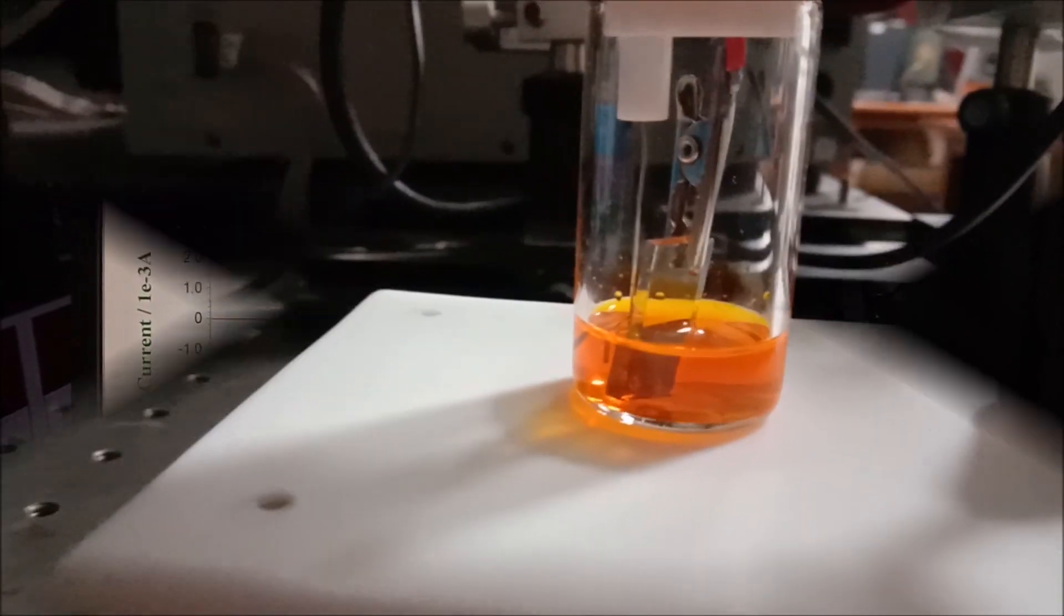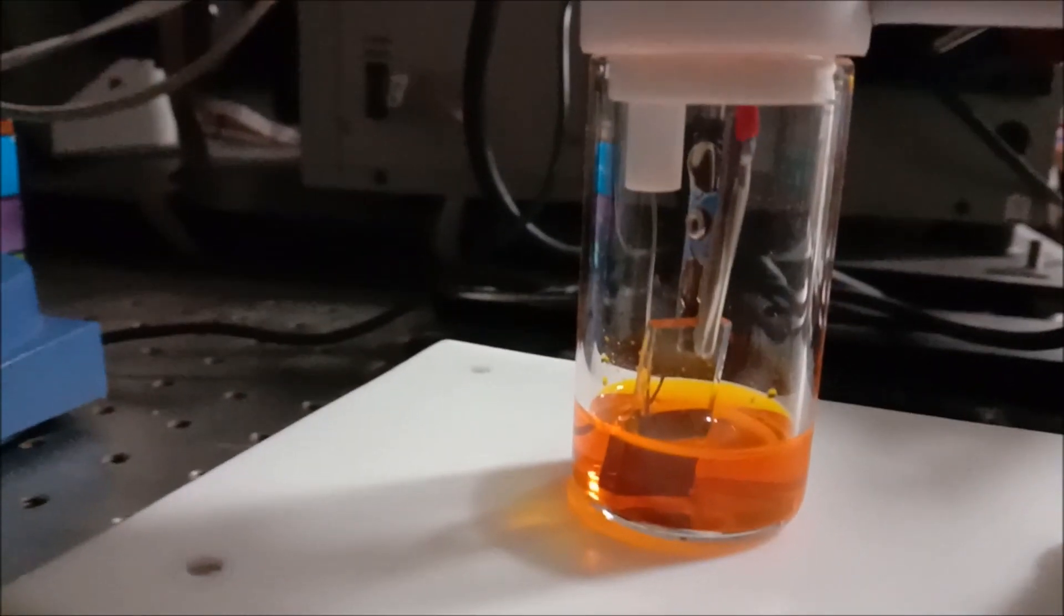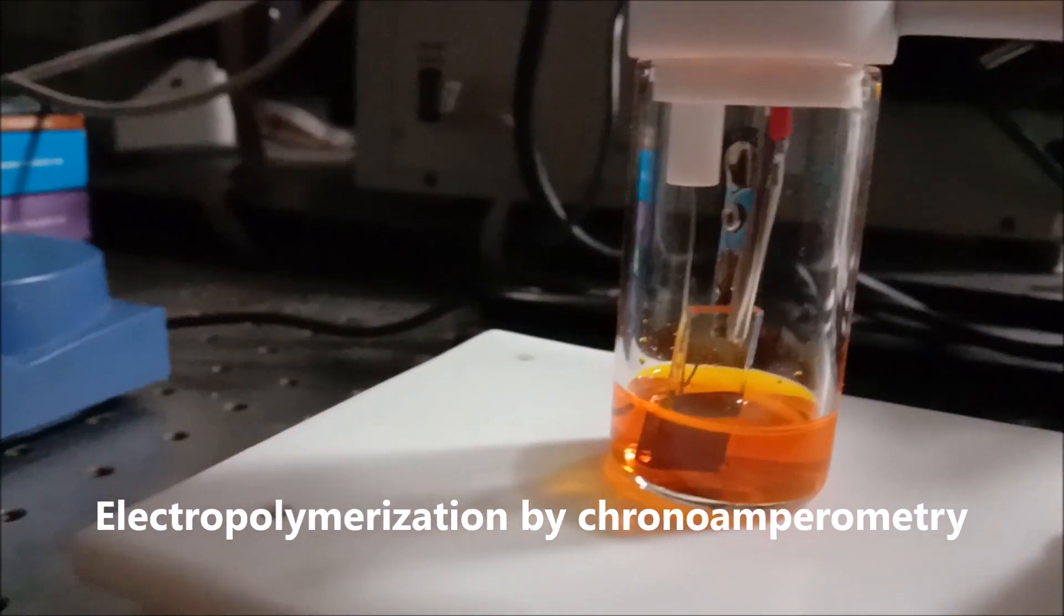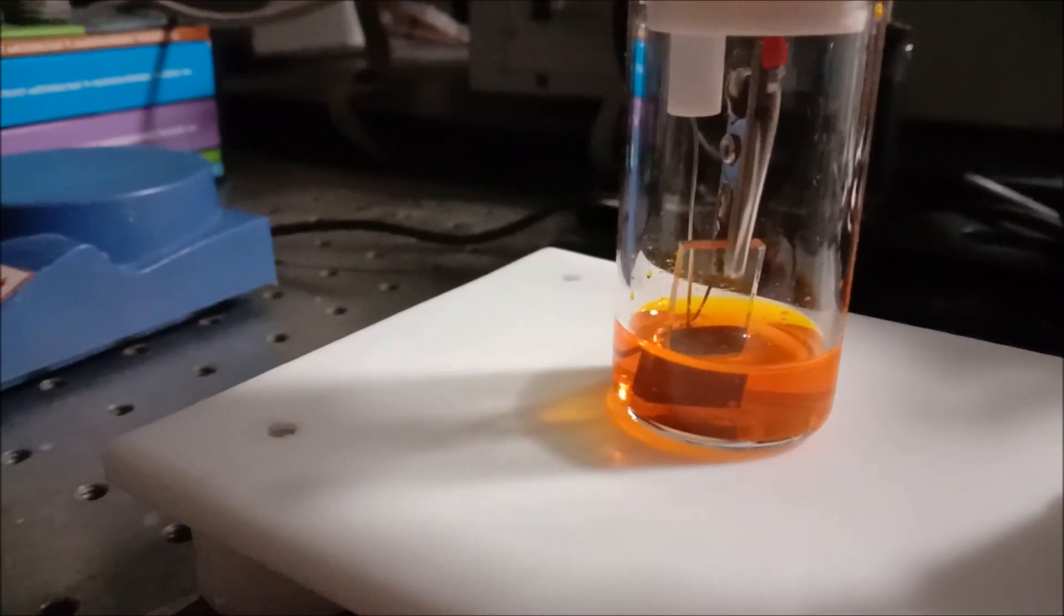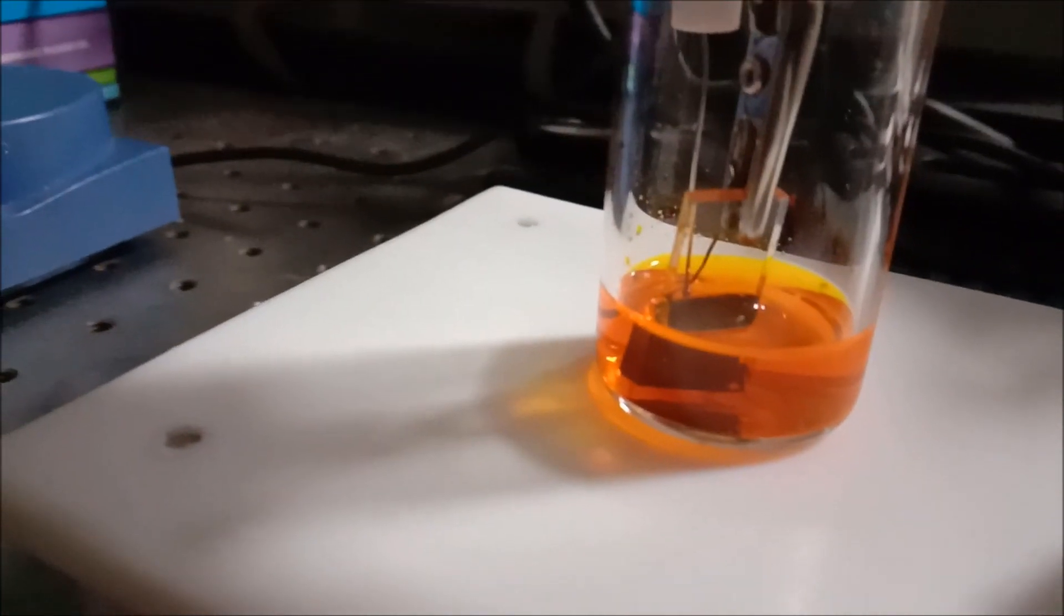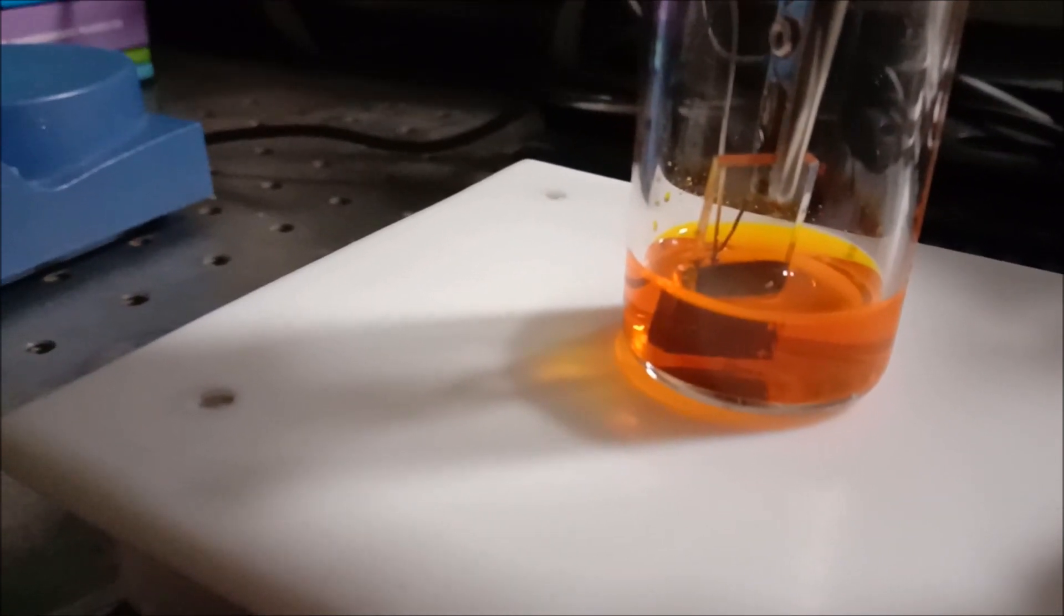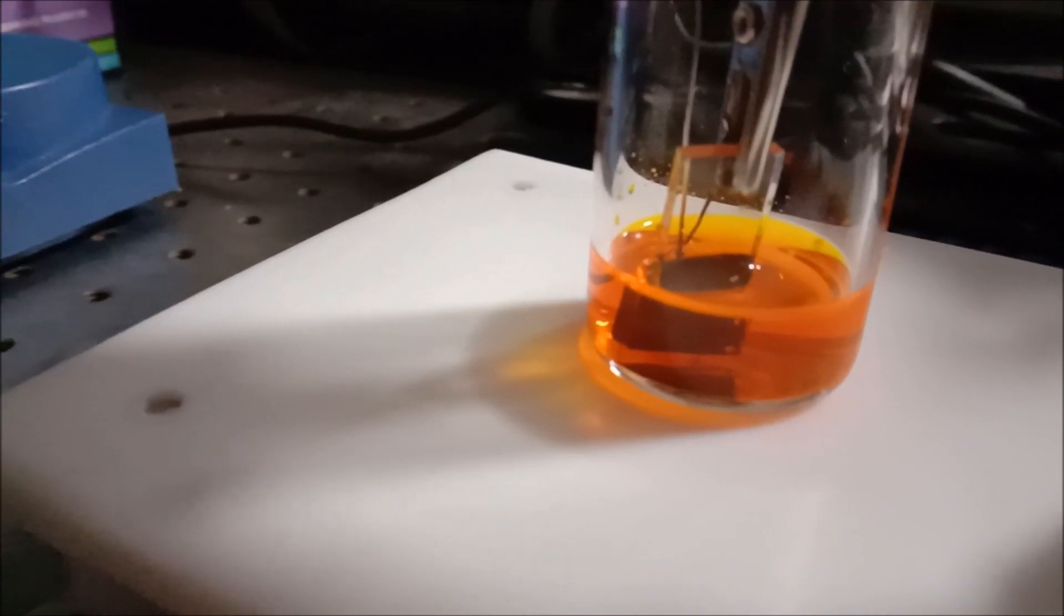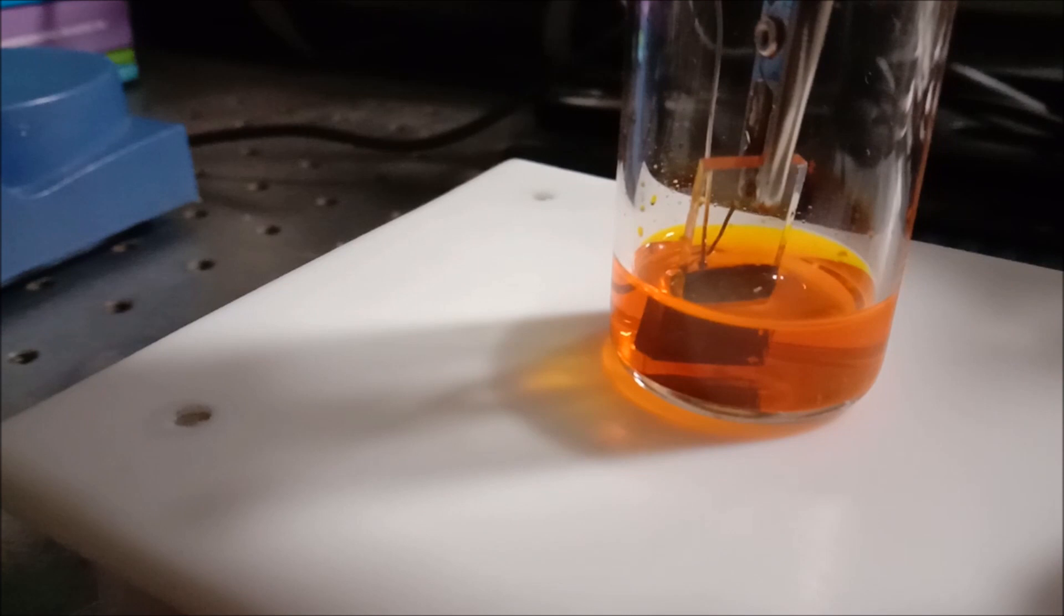Now we are performing the electropolymerization using chronoamperometry, setting a particular voltage determined from the LSB. Now you can see that film formation is uniform at that particular voltage. We have chosen that particular voltage at which we earlier obtained that extreme darkness of the deposited material.